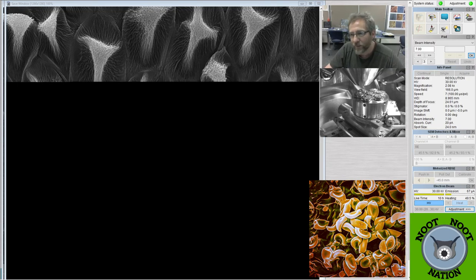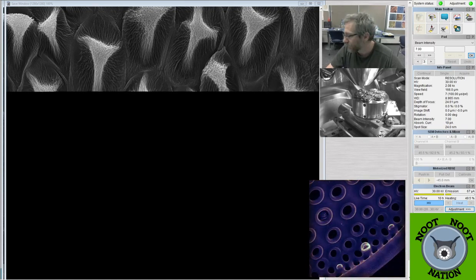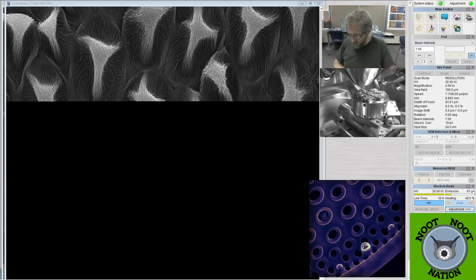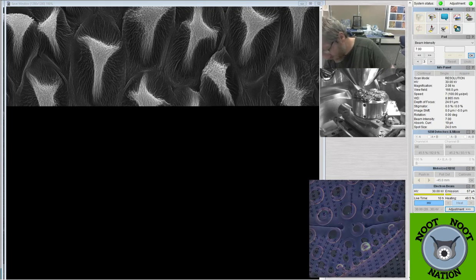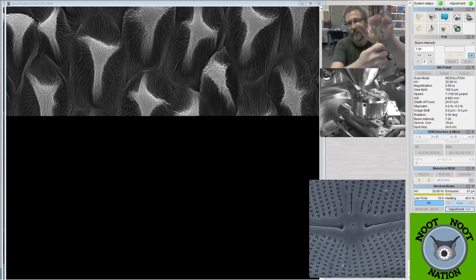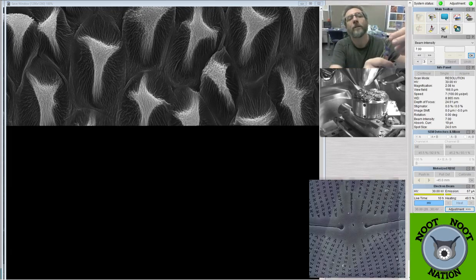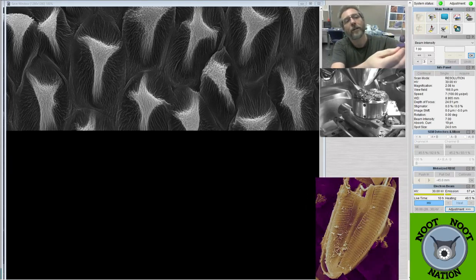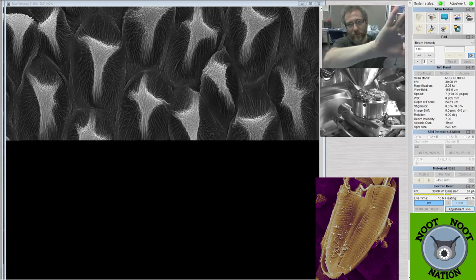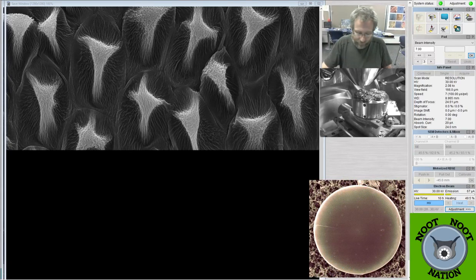Kitty Cruz says, what kind of prep does a sample like this take? I literally went out to my yard this morning before I came in. So we're looking at violets. If you're not familiar with what a violet is, they look like this. Here you go. It's just a purple flower with white. And the ones in my yard are either purple with white or white with purple. So it's this flower that we're looking at right now, and we're actually looking at the cells for these.